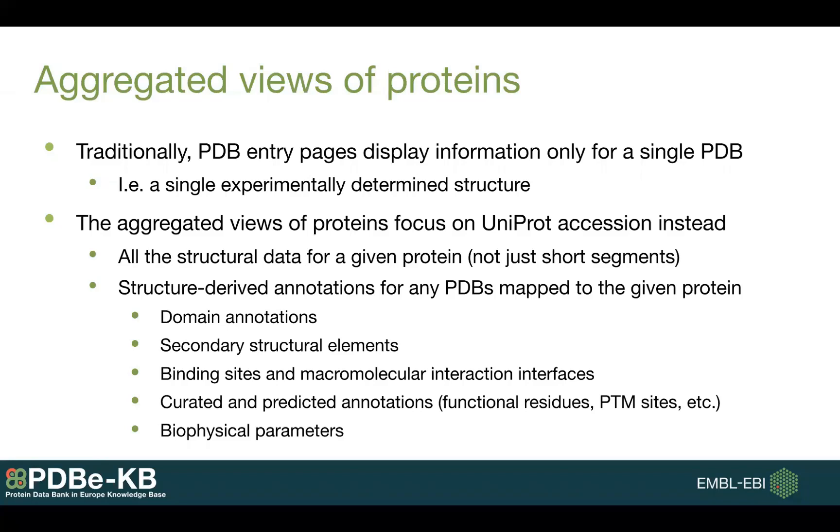The reasoning behind these aggregated views is that traditionally PDB entry pages display information for one specific PDB, logically enough. But this means that if you are interested in a full-length protein, you often have to visit many different pages and get the data from each of these places and compile it yourself.